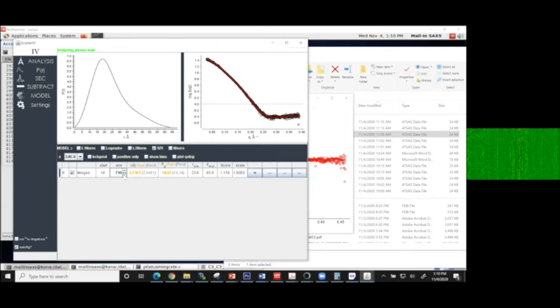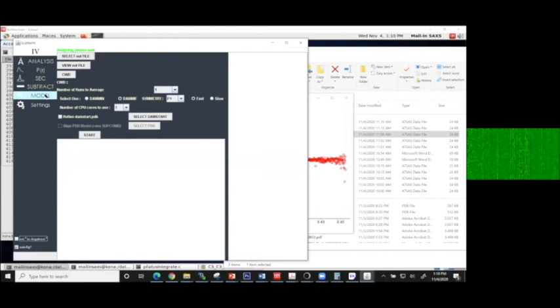All right, so you would do this, and then you're ready to generate shapes. Basically, the output of this step will give you a .out file, which you can now feed into the shape restoration programs. And if you've got it all hooked up properly, let's see, where are you?